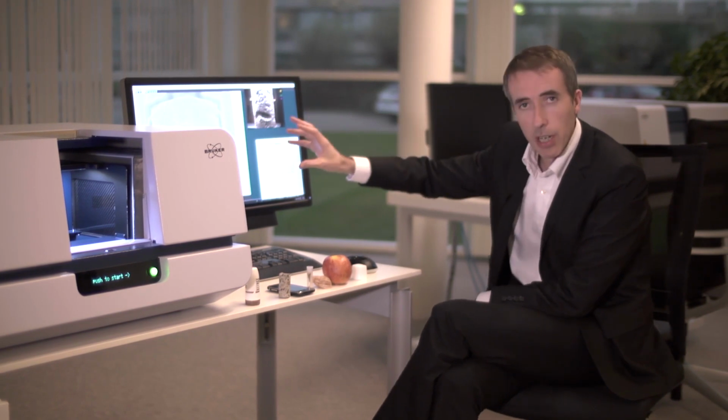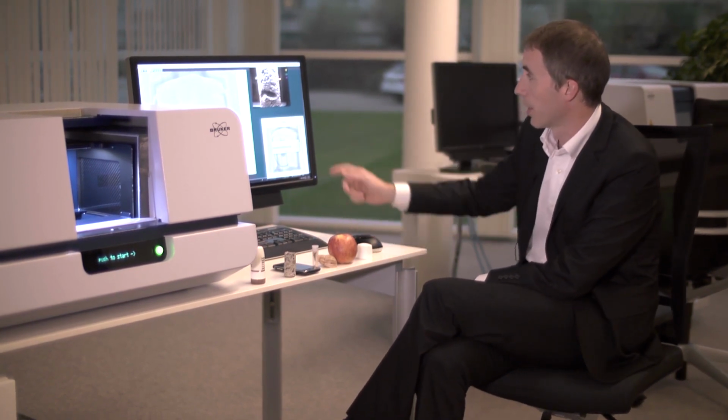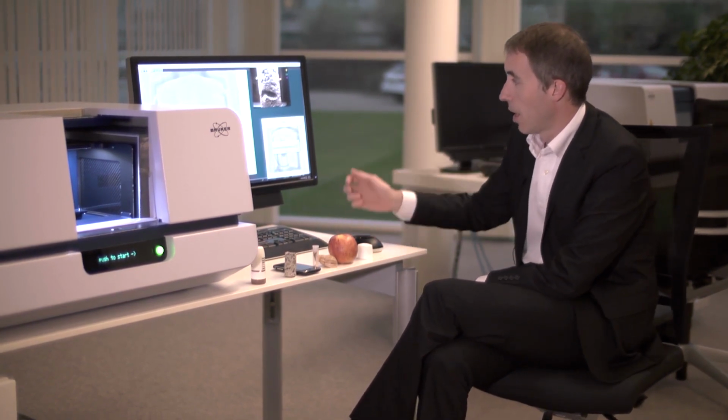In the meantime, the data of the projection images is loaded in the reconstruction program. And using the GPU, which is a graphical card interface, the reconstruction process is very fast. It can speed up the whole reconstruction to a matter of seconds, as you can see here while it's running in the background. And you see again, this is fully automated.